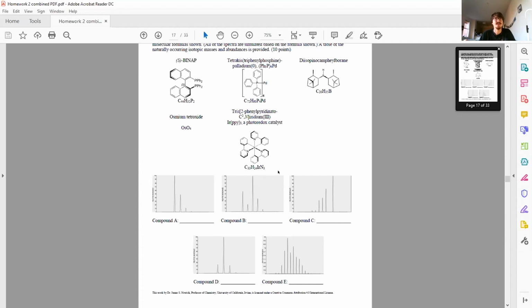Nitrogen 15 is 0.38% and nitrogen 14 is 99.62%. Okay, right, more carbons. Carbon has the higher isotopic abundance of the heavy isotope. So yes, I think those can be explained by carbon, which leaves boron for compound D.